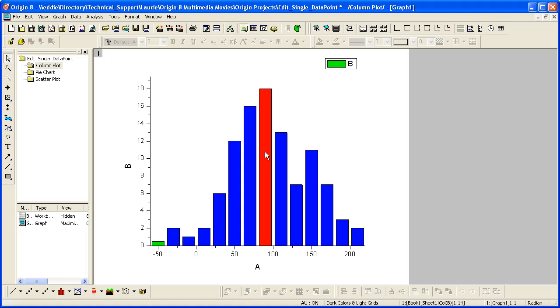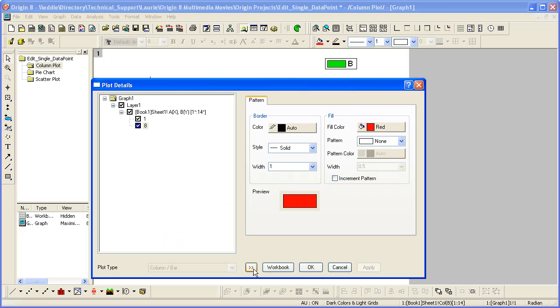Double clicking on these columns opens plot details. And you'll see that for as many points as I control double clicked on, I'll see an entry here in the left panel of the dialog.